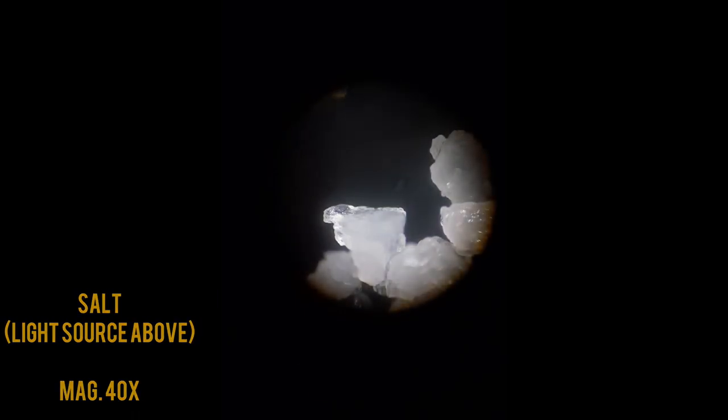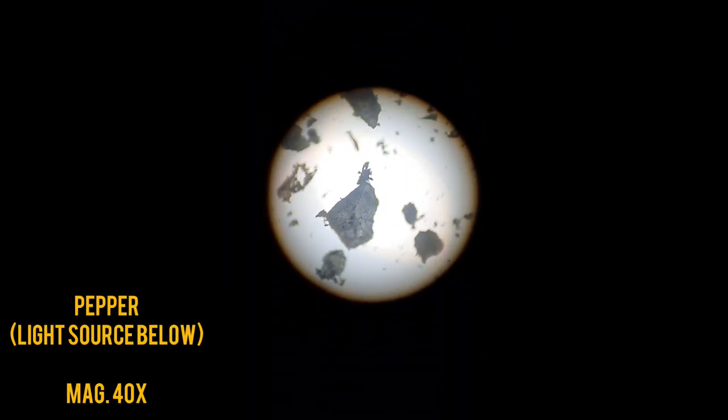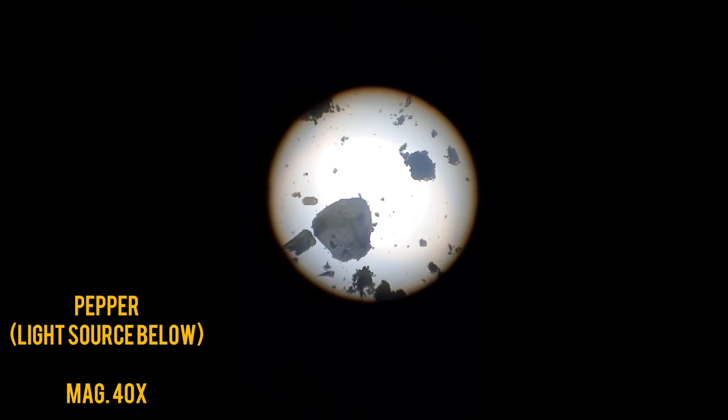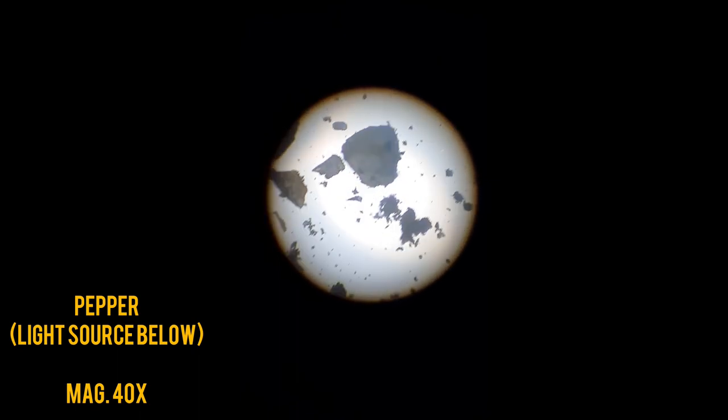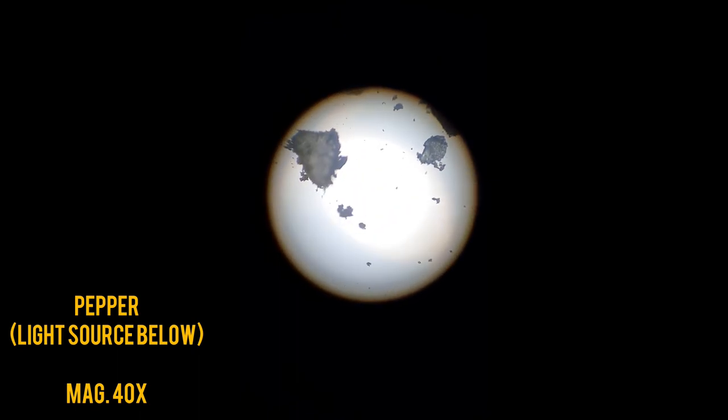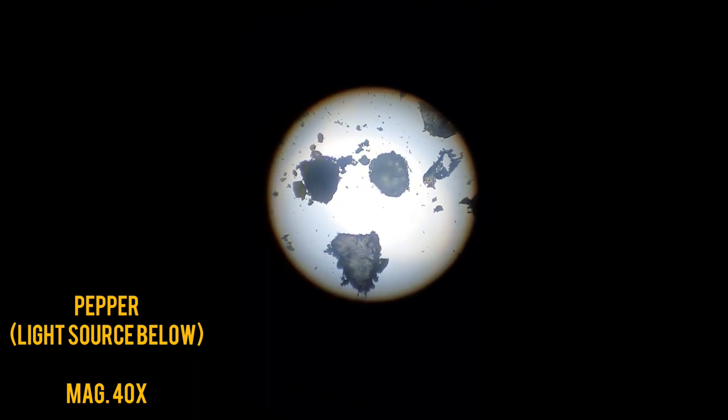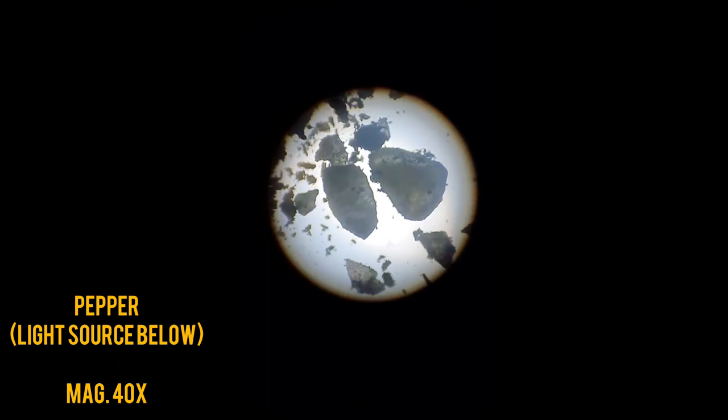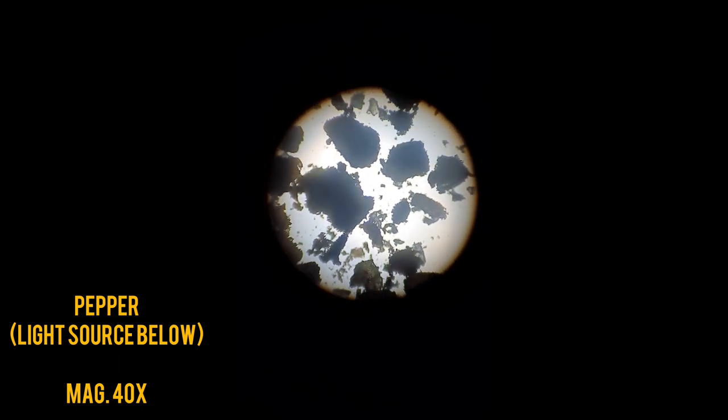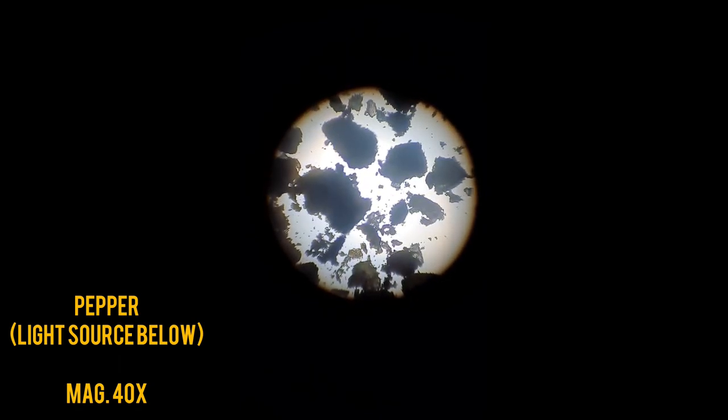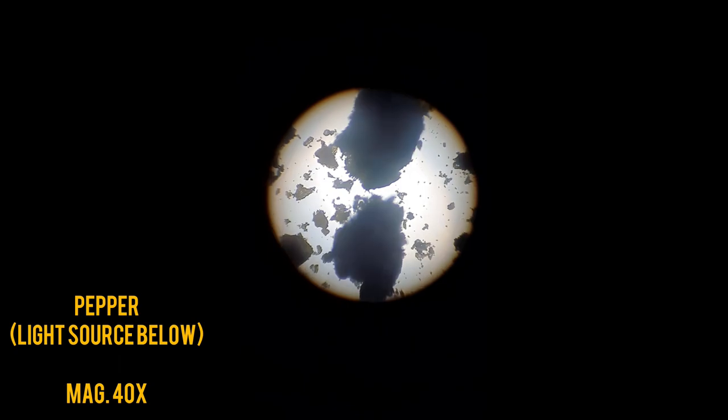Let us now go to our next additive. Achoo! Sorry for that. Pepper makes my nose itchy. So, this is what ground pepper looks like under a microscope. Pepper has been traded since 1,000 BC. Just like the two previously mentioned food additives, pepper had a huge impact on the political and economical events in the past.